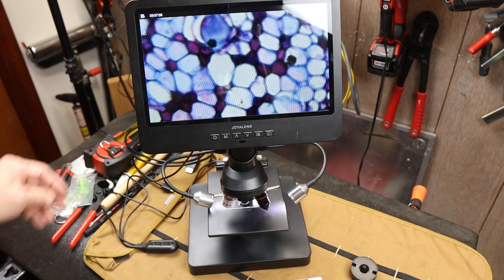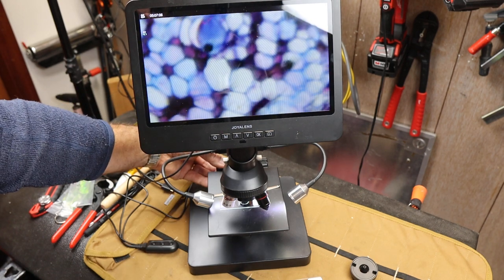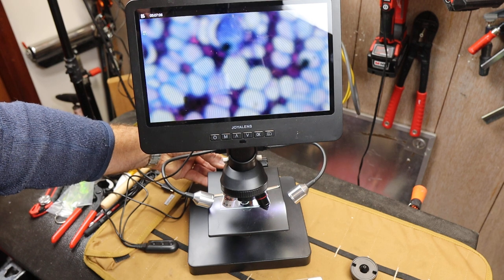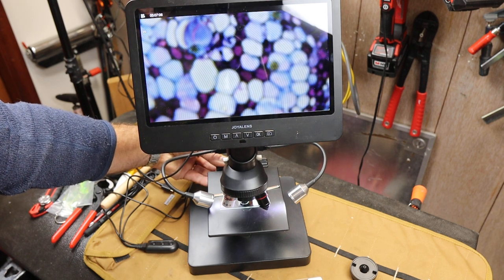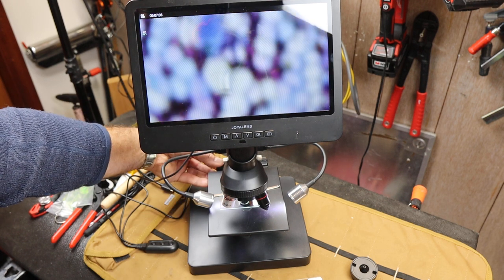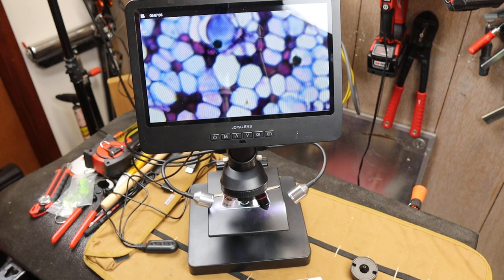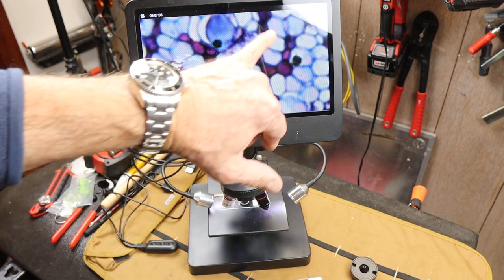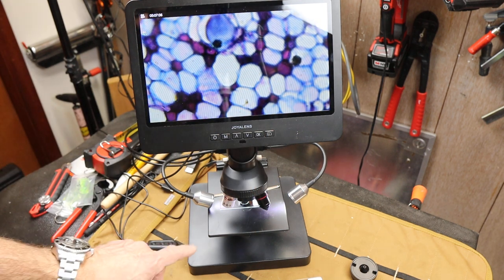So just crystal clear. It's a lot clearer on the screen. But you can see just the power of this to try to get the cellular structure.